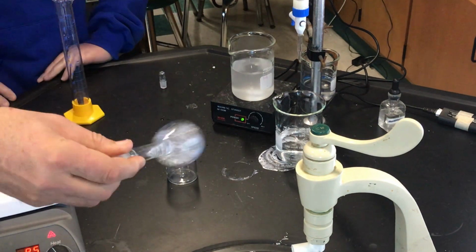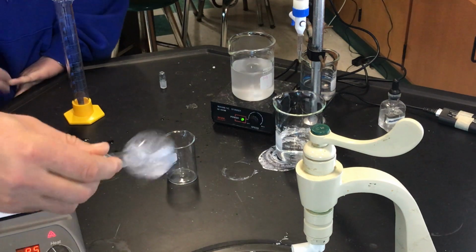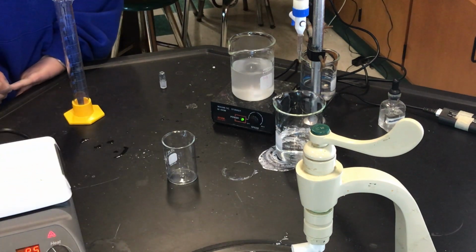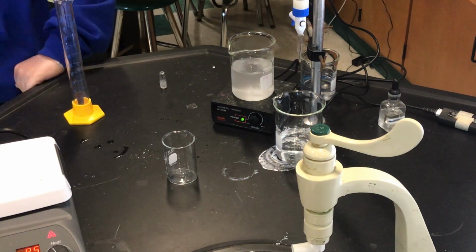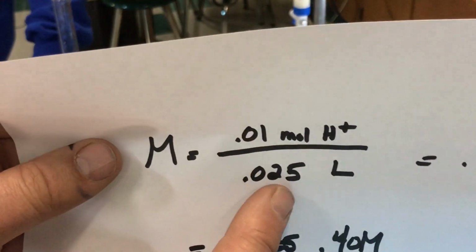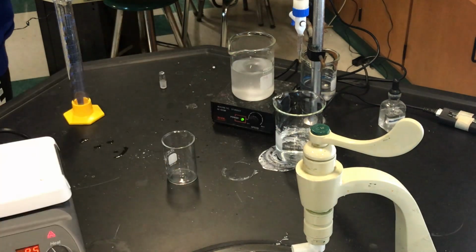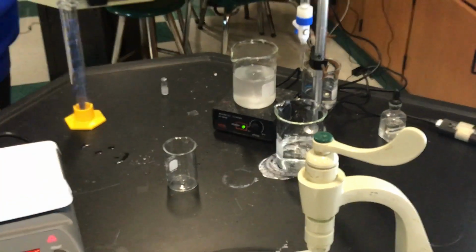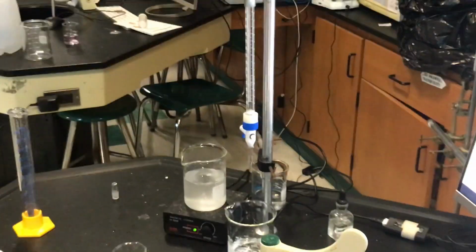So this is what student L did. She measured 25 milliliters of them, and we made 50. Okay. We're only going to need, what was the projection? We calculated that we wanted to use what? 25. We have a burette here that holds 50, okay? So right now we're going to use some of it to wash out.